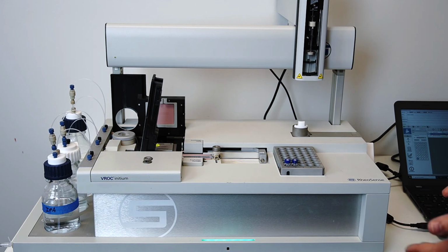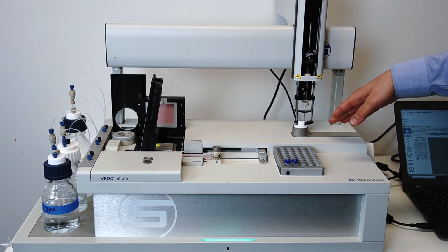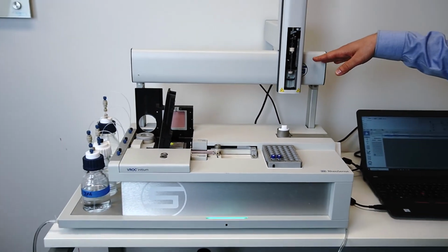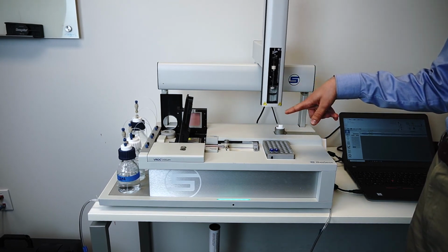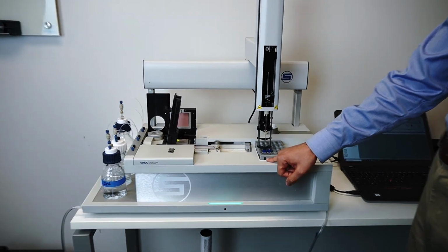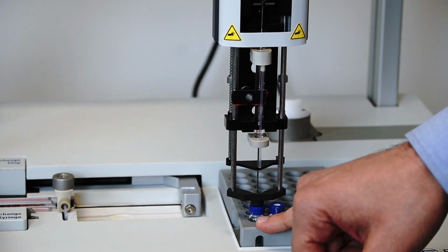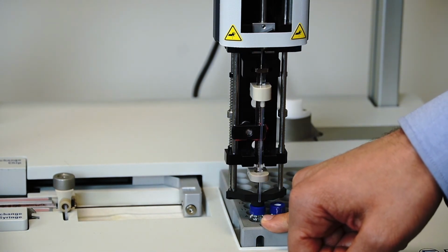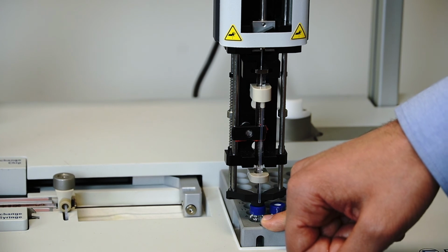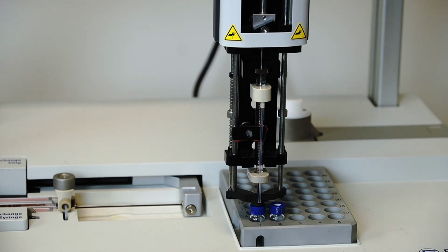Alright, so now that the pre-run diagnostics are done, the autosampler will now first test to make sure that it's calibrated appropriately. And now it'll move to the first sample, and it's set to pre-pressurization. So it pumps air into the vial, and it will now begin drawing up sample. And so it's automatically drawing the sample. Here I have it set to draw about 73 microliters.